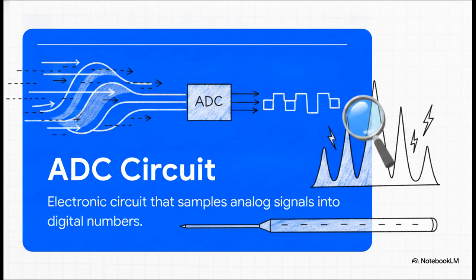Now, that ADC circuit, the analog to digital converter, is literally the star of the show. We are talking about a sampling frequency of a few hundred hertz. Why so incredibly fast? Well, if you're using capillary columns, you're going to get some extremely narrow chromatographic peaks. If your ADC circuit isn't slicing that signal hundreds of times a second, it's going to completely miss the peak, and your area measurements will be totally off. This conversion happens right at the input of the recording integrator.